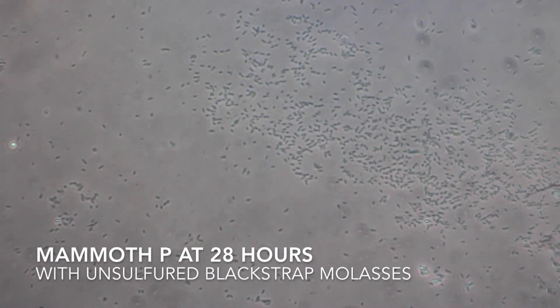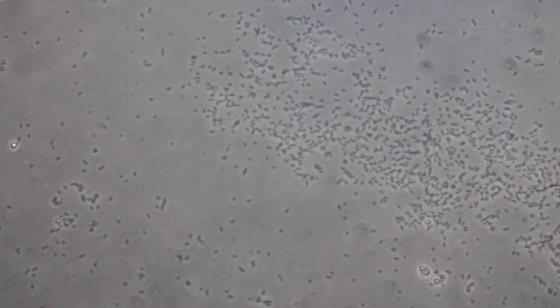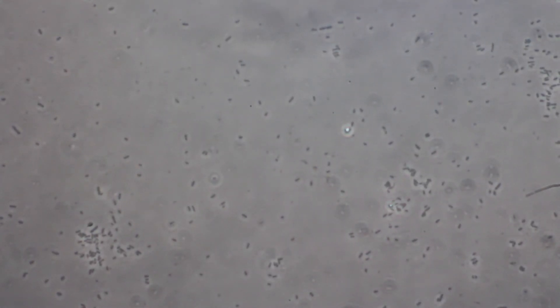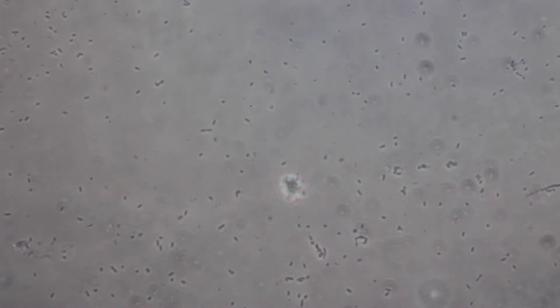By comparison, here's the Mammoth P with the molasses and distilled water at 28 hours. As you can see, there's quite a bit of bacterial biomass, but it appears we don't have the same level of diversity that we were getting by feeding it a more diversified food source like the microbe catalyst. We do appear to be feeding at least one species of bacteria that seems pretty happy. This is pretty much what most of the slide looks like, with just a few pockets of really high density.